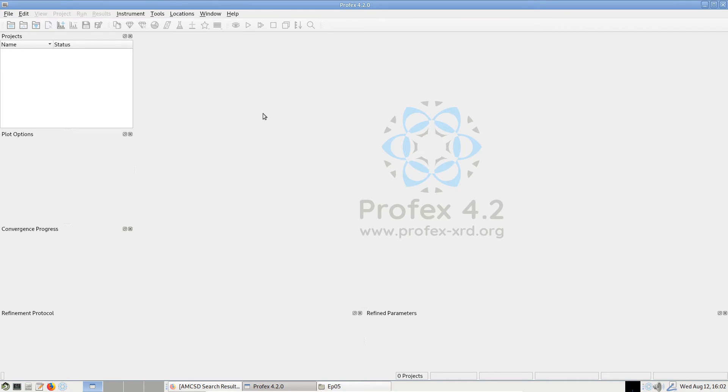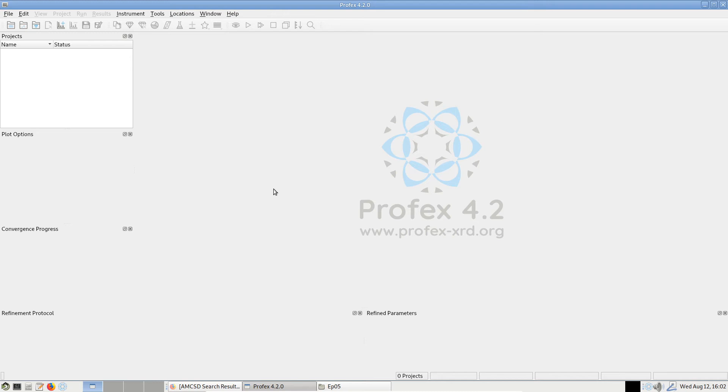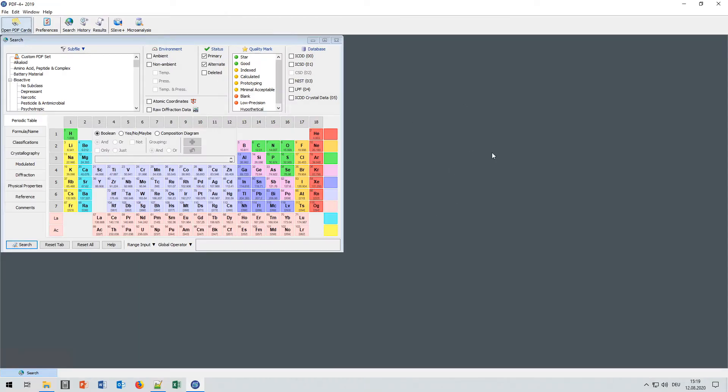If you have access to a commercial database like the PDF4 from the ICDD, the International Center for Diffraction Data, this is a very good source for structure information. However, you need the version 4, the PDF4 database, because the cheaper PDF2 database does not contain structural information. It only contains diffraction lines. This is the front end for the PDF4 database.